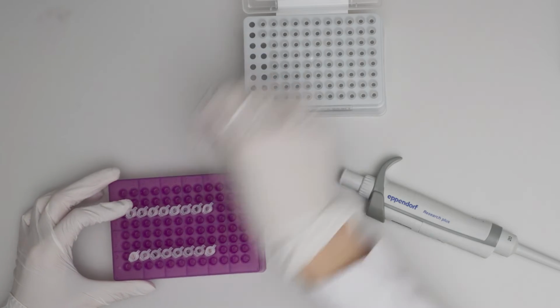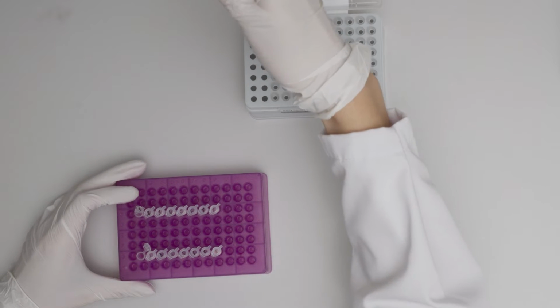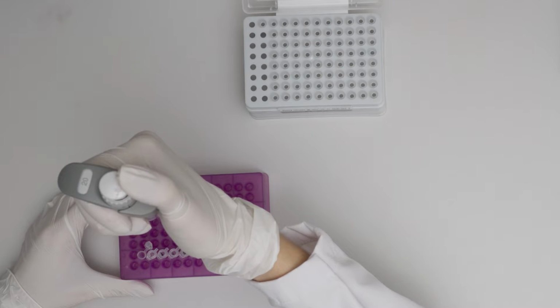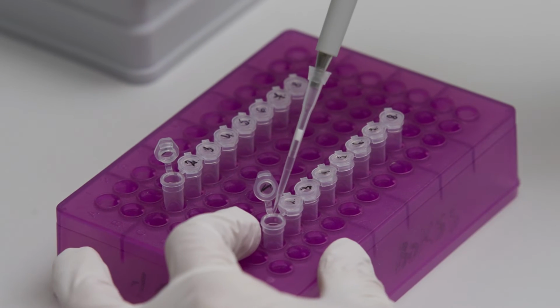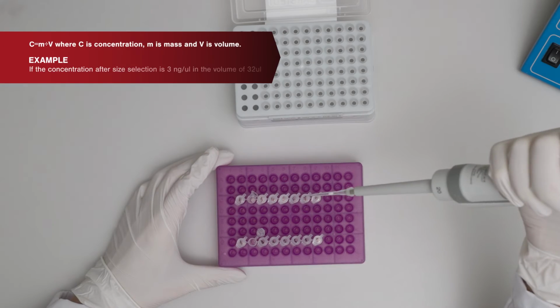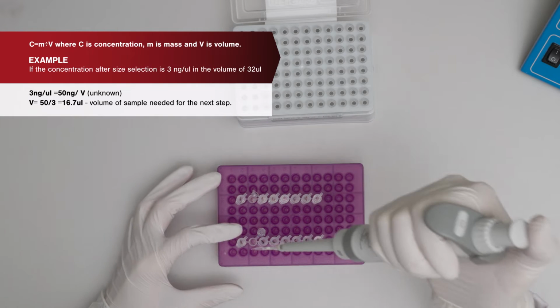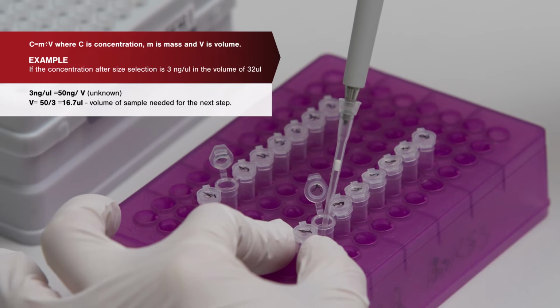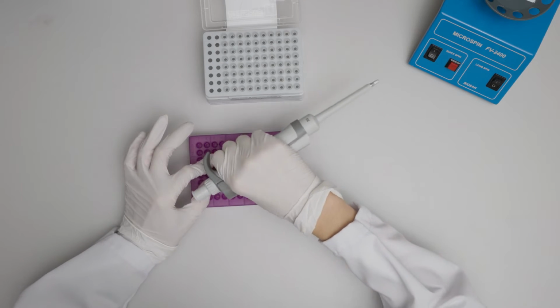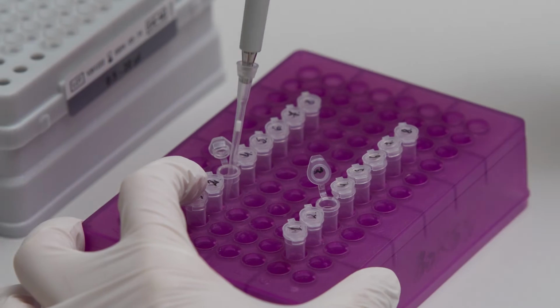50 nanograms in volume that does not exceed 40 microliters is the recommended amount of DNA. However, the protocol is suitable for as small amounts as 5 nanograms. If smaller amounts are used, several adjustments should be made according to the protocol. When doing calculations, please use the following formula. 50 nanograms of the fragmented size-selected sample from the previous step is transferred to a new 200 microliter PCR tube.